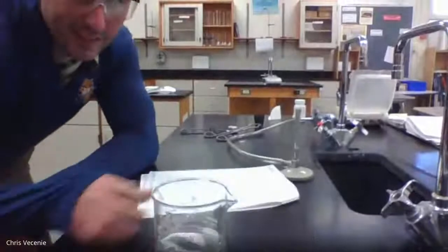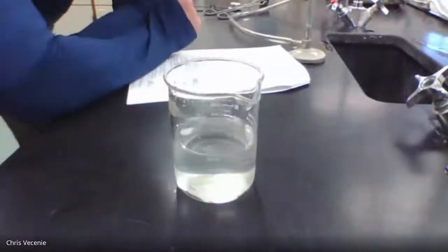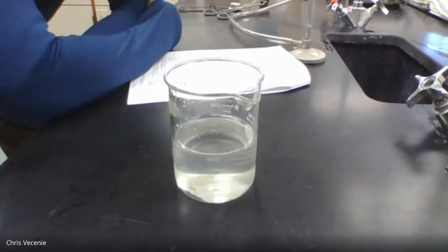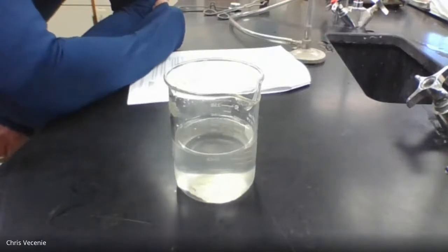All right, so what you guys have here is our dissolved metal carbonate, where we don't know who it is. All right, now we're into step 11. It says add about 125 milliliters of CaCl2. And it doesn't matter if it's perfect because I'm making the CaCl2 be in excess.